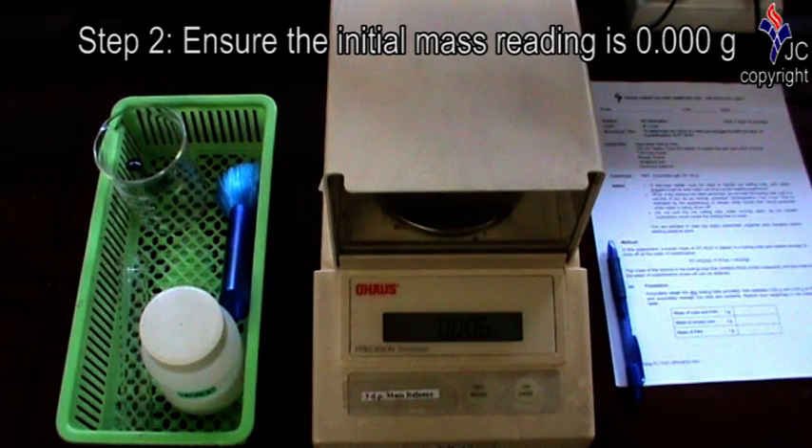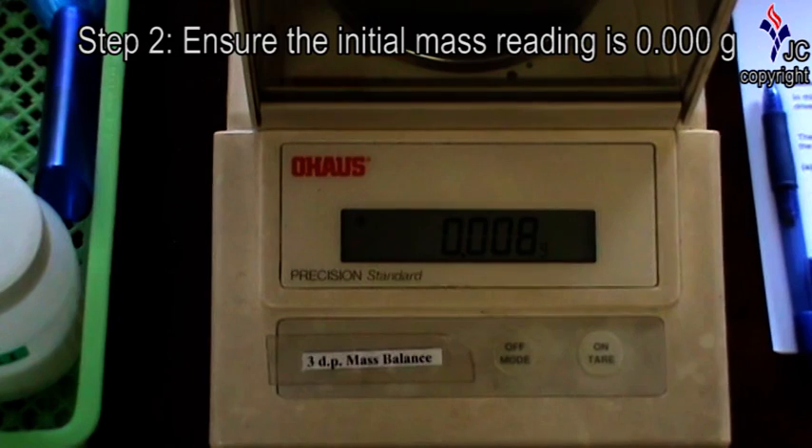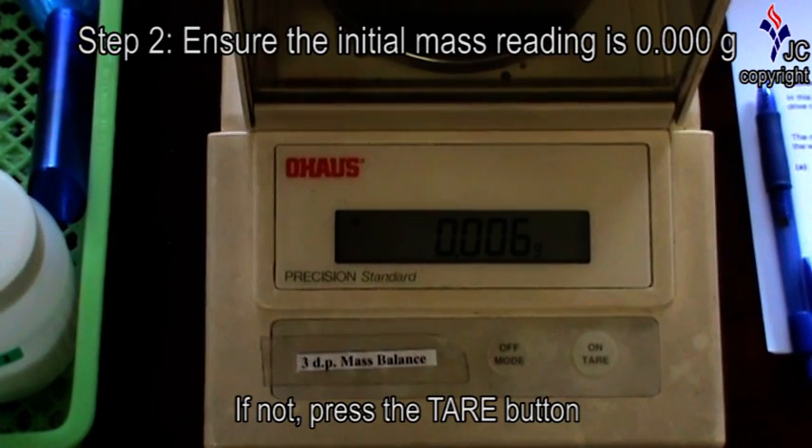With the cover of the weighing balance closed, check that the mass reading is 0.000 grams. If not, press the tare button.